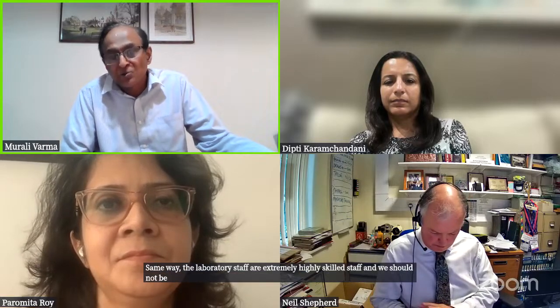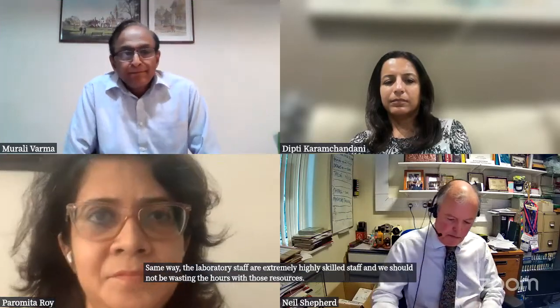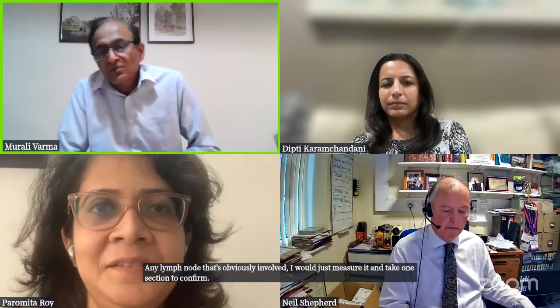Same way, the laboratory staff are extremely highly skilled, and we should not be wasting those resources. Just a related question. In head and neck resections, where lymph nodes are obviously involved with metastatic tumor, should we still embed them all? I would agree. Any lymph node that's obviously involved, I'll just measure it and take one section to confirm that it's tumor.